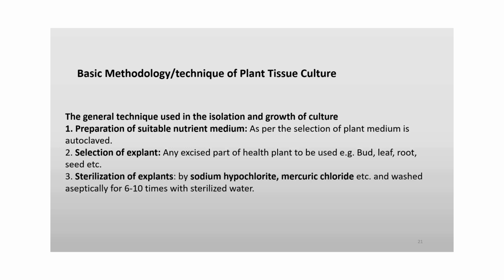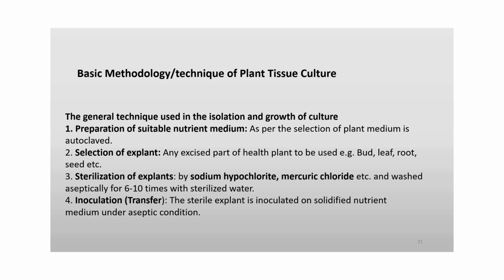Sterilization of the explant is needed, by sodium hypochlorite, mercuric chloride, etc., and wash aseptically 6 to 10 times with sterile water. Inoculation, transfer: the sterile explant is inoculated on a solid or solidified nutrient medium under aseptic conditions.